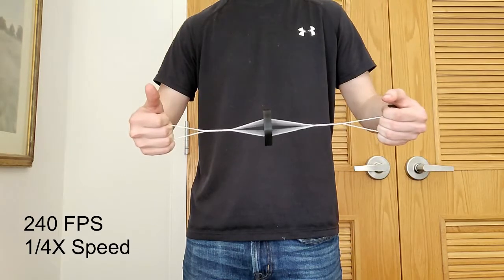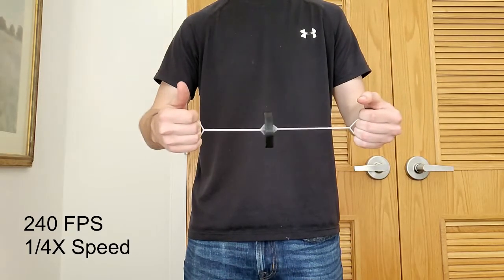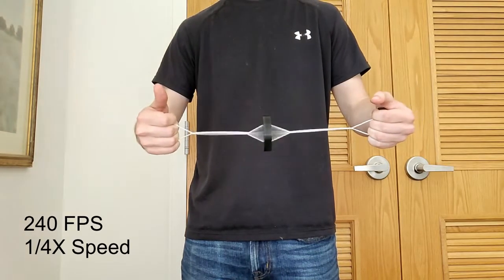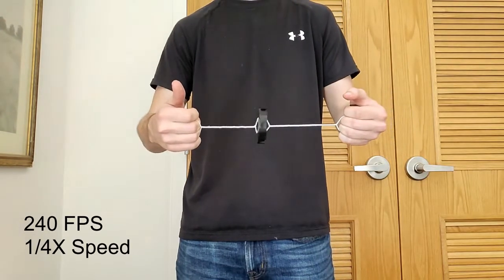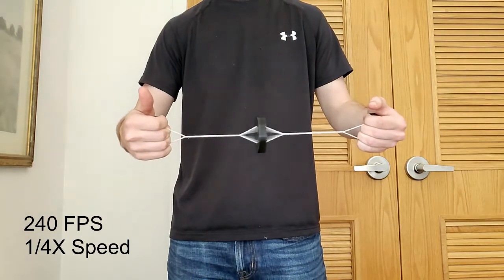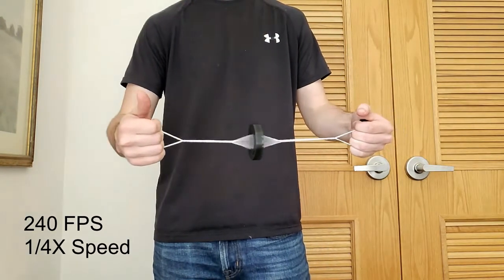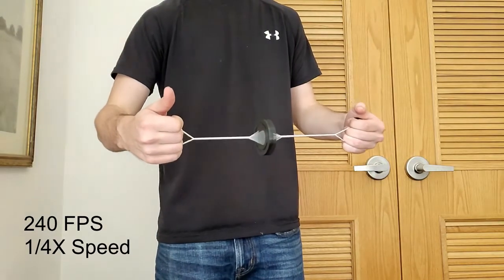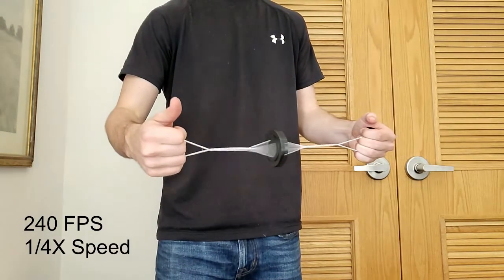I'm not exactly sure why there's such a large difference between my device and the original paper. It could be caused by differences in the materials used in the device, or it could be that I just wasn't running the device at its maximum speed. Whatever the case, I'll have to experiment with it more and see how it fares in actual real-world applications.